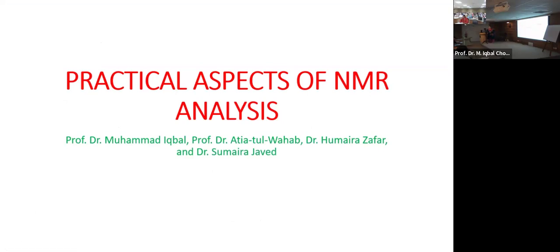The theory that you have been studying so far in the last two classes is the same. But for large molecules and small molecules, there are some differences in NMR spectroscopy, though not in terms of analysis, because for large molecules we usually have to use 3D, 4D or 5D NMR.